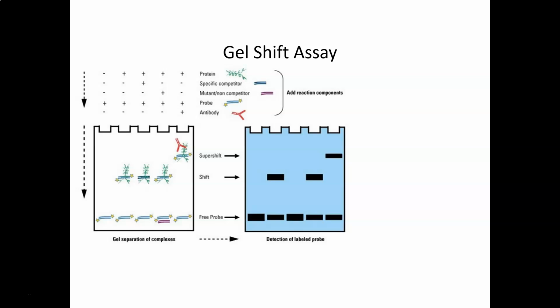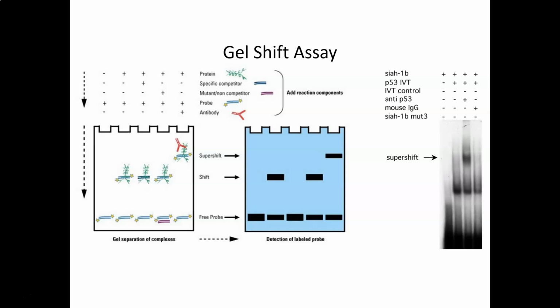A really nice example, not only of measuring DNA binding and of gel shift assays, but also the contortions that experimental biologists and chemists must often put themselves through to disprove any alternative interpretation of their data and only have their conclusion fortified by the evidence of the data. So here's an example of that very type of experiment. Again, just to show you that this isn't just a conjecture, this isn't make-believe, that this is done in labs.